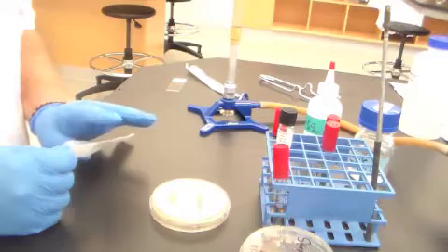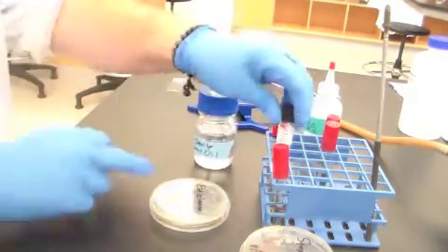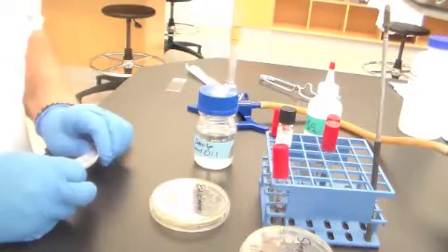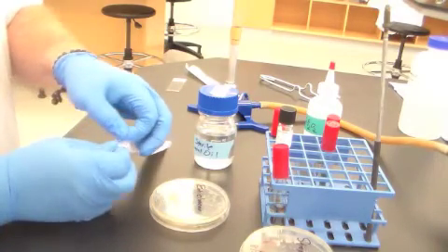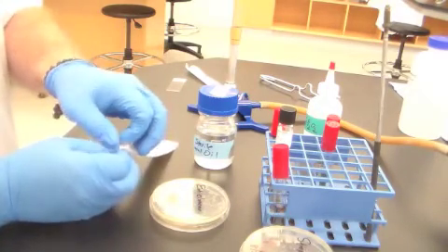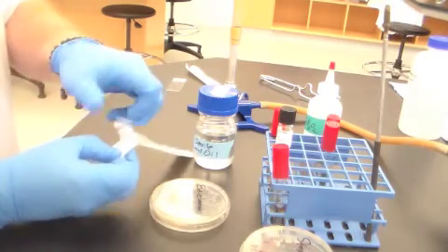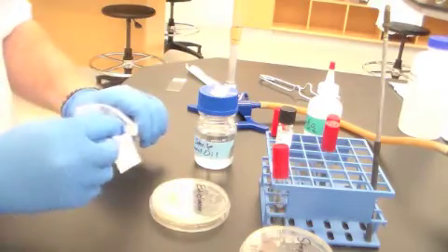And so the glucose is there just to allow an initial burst of bacterial growth to hopefully utilize all of the available oxygen. Now, to keep oxygen in this headspace from diffusing back in and preventing an anaerobic environment, we're going to place a vapor barrier on top of each one of these decarboxylase broths. So we have sterile transfer pipettes, and we have sterile mineral oil.